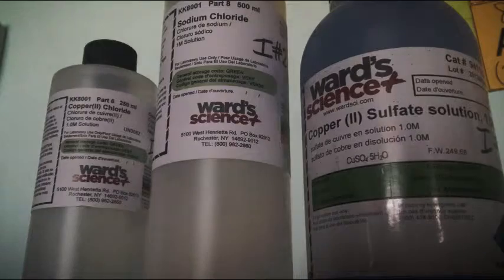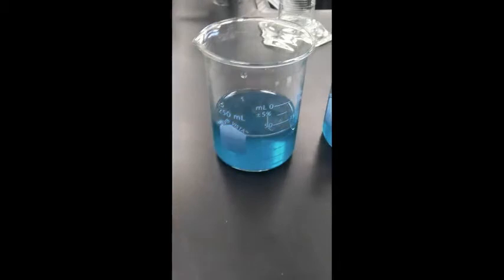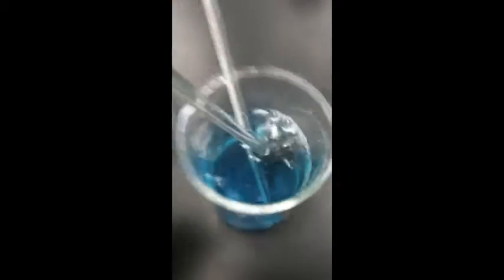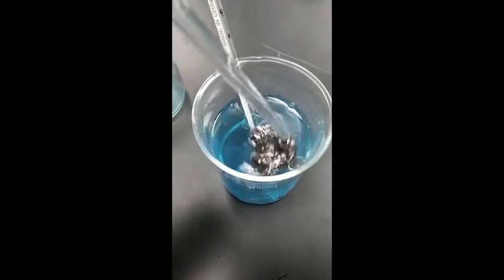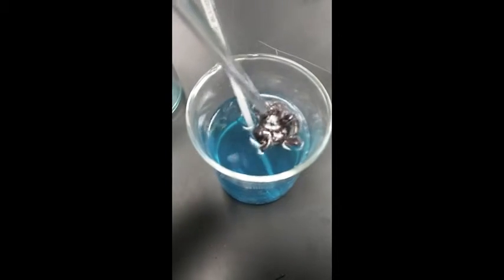I used 3 different solutions in my project, which include copper(II) chloride solution, copper(II) sulfate solution, sodium chloride solution, and a mix between copper(II) sulfate solution and sodium chloride solution. I poured just enough of each solution in a beaker, took its temperature, and submerged the aluminum foil in each solution to watch if there was a reaction that was going to take place. I then took the temperature of the solution after the reaction took place.